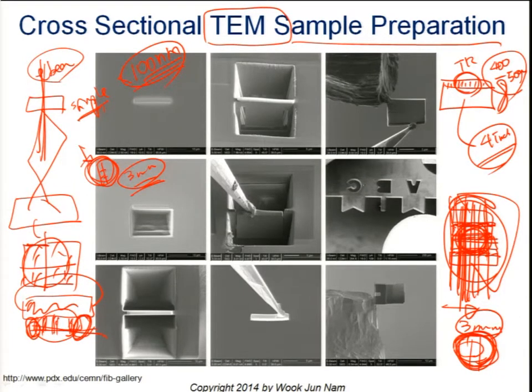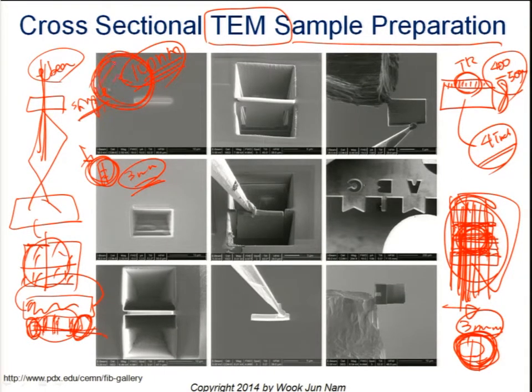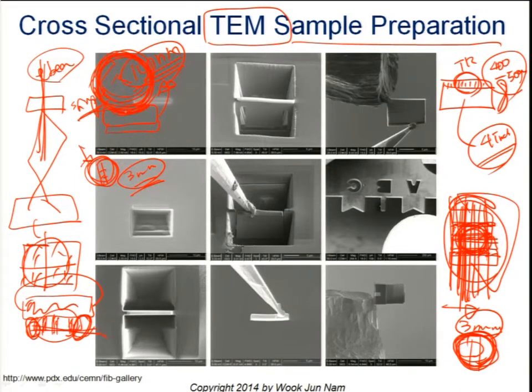After this, there is another small wheel, turning like this, and we position the sample-loaded grid, and as the wheel keeps rotating, it keeps making the center area thinner and thinner. This grid has a hole. There is a light from the back side of this tool, and it has a simple optical microscope.